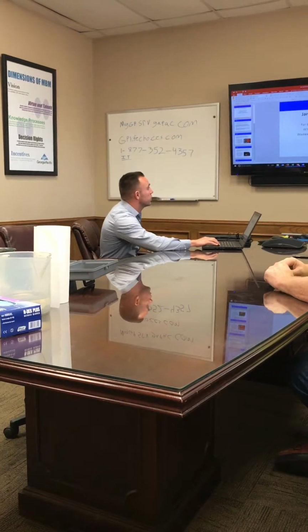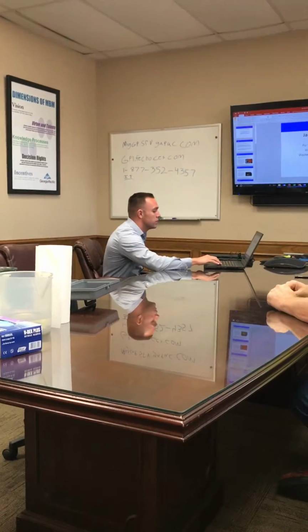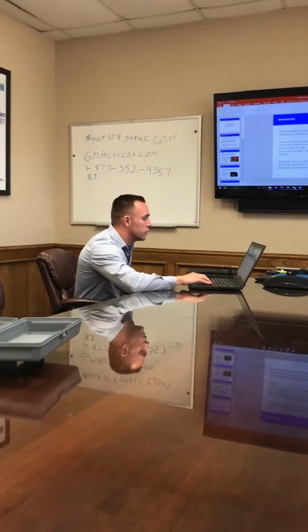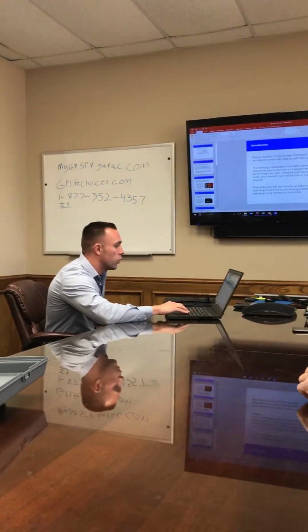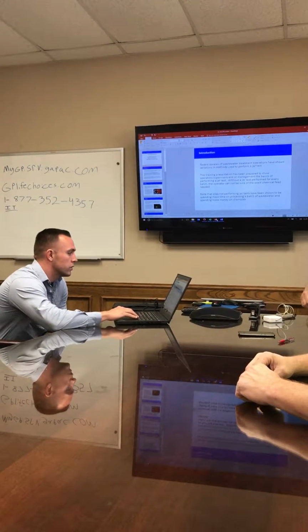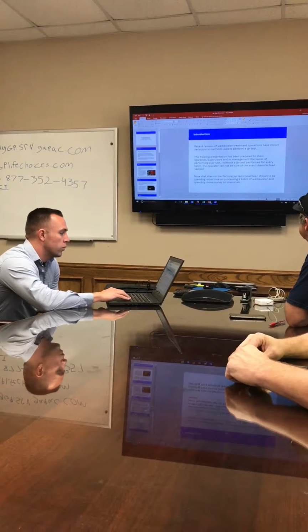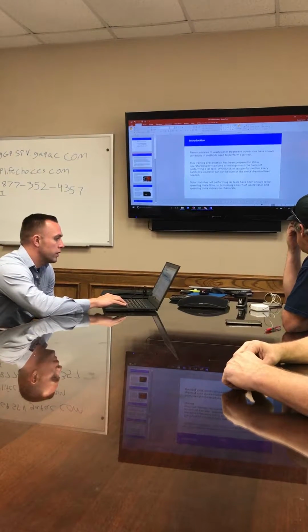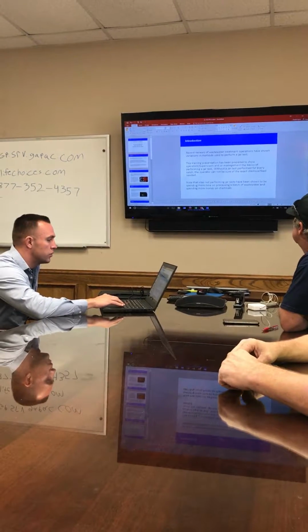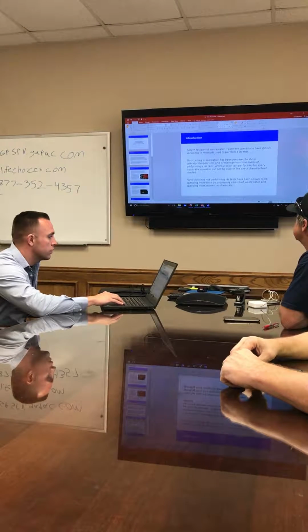So I'm just going to go over the jar testing procedure for converting operations with physical and chemical wastewater treatment systems. Recent reviews of wastewater treatment operations have shown variations in methods used to perform a jar test. This training presentation has been prepared to show operators, supervisors, and/or management the basics of performing a jar test. Without a jar test performed for every batch, the operator cannot be sure of the exact chemical feed needed. Note, sites not performing jar tests have been shown to be spending more time on processing a batch of wastewater and spending more money on chemicals.